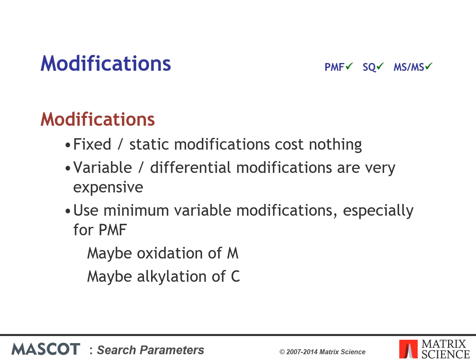In contrast, most post-translational modifications do not apply to all instances of a residue. For example, phosphorylation might affect just one serine in a peptide containing many serines. These variable or differential or non-quantitative modifications are expensive in the sense that they increase the time taken for the search and reduce its specificity. This is because the software has to permute out all the possible arrangements of modified and unmodified residues that fit to the peptide molecular mass.